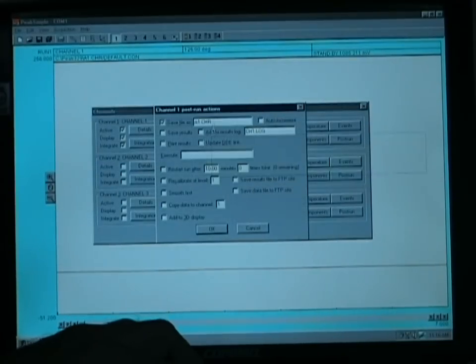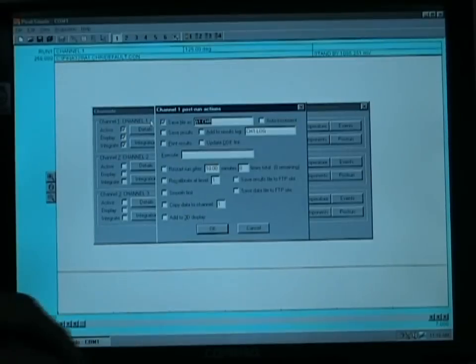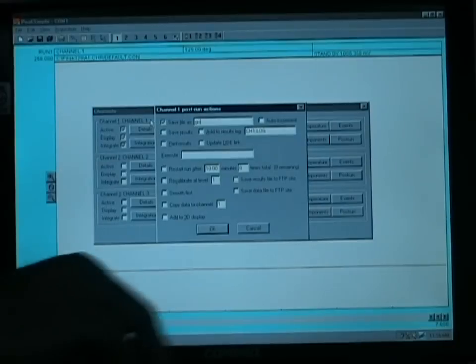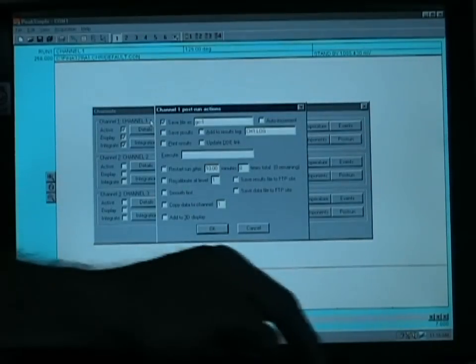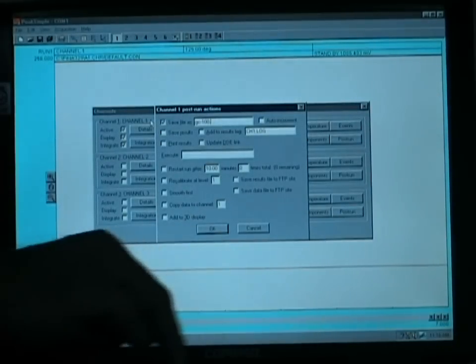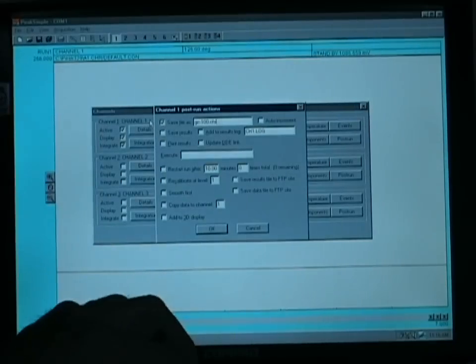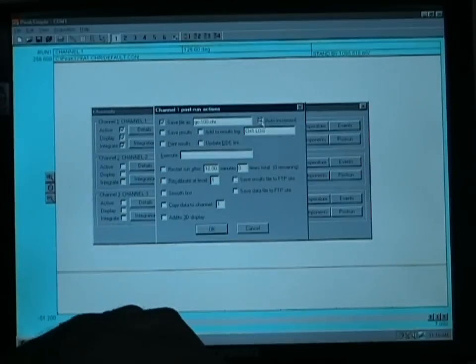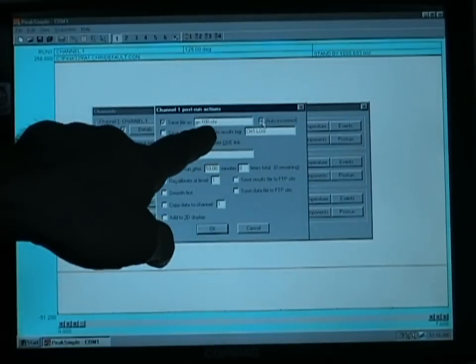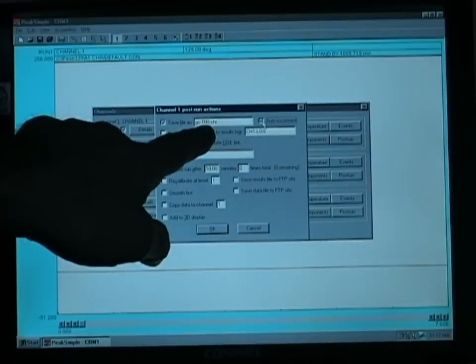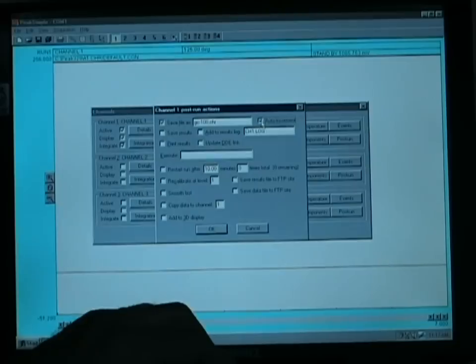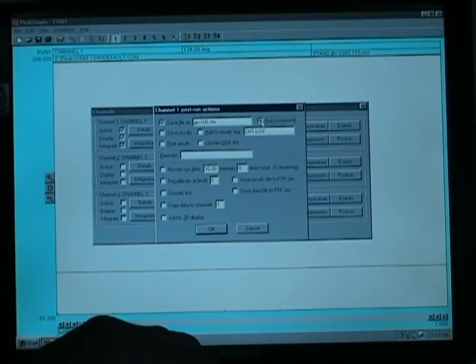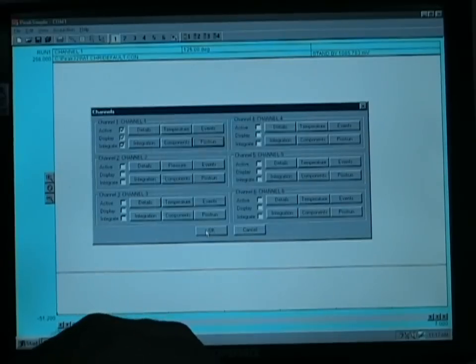The Post Run screen allows us to define a file name, and we will call this GC-100.chr for our binary chromatogram file, and if you select the Auto Increment feature, it will automatically give the next file name GC-101, followed by GC-102, etc. This eliminates the need for the student or the teaching assistant to have to rename each file prior to running the chromatography.